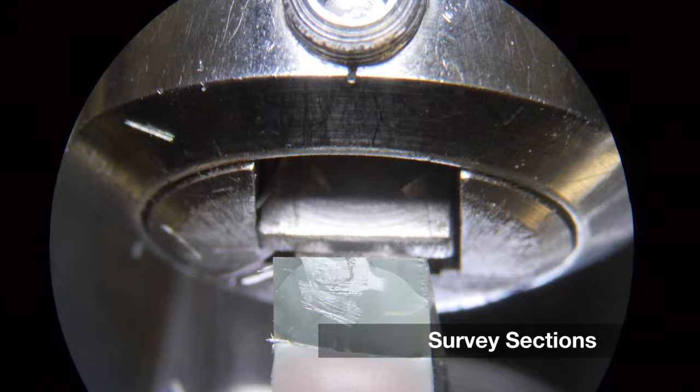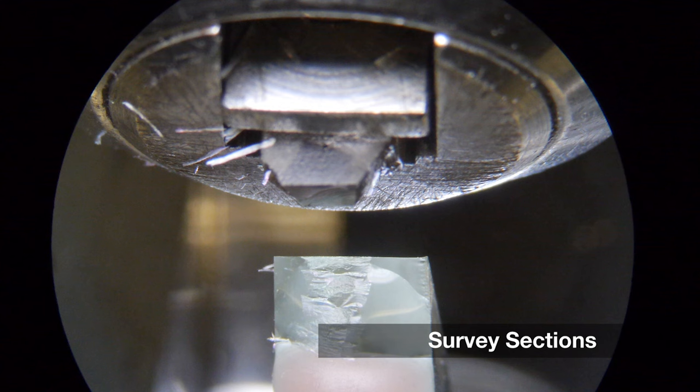The water bath is filled with water and sections, about 0.5 microns in thickness, are cut. These sections are called survey sections.